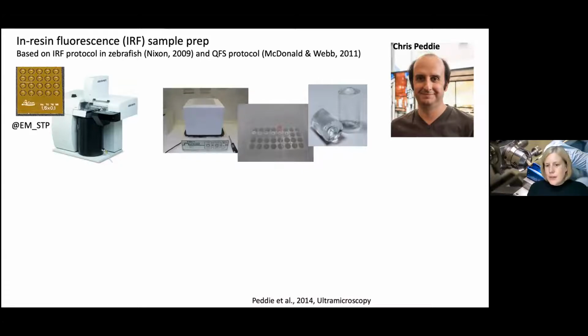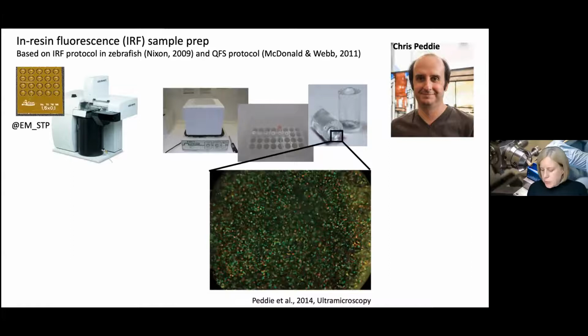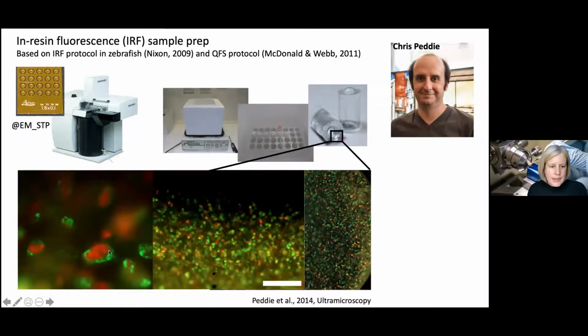And we also maintain a small percentage of water because GFP, YFP and mCherry need a hydration shell to fluoresce. And then we go into a methacrylate resin, which will tolerate a small proportion of water and has a very low autofluorescence itself. And when you do that, you preserve the fluorescent proteins in the block face. And when you zoom in, you can see cells. And you can still see here mCherry-H2B and GFP-C1. And that's labeling diacylglycerol and cell membranes.